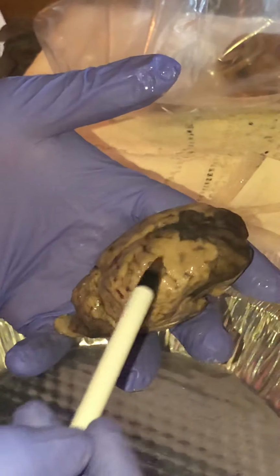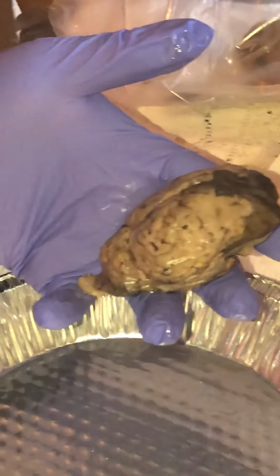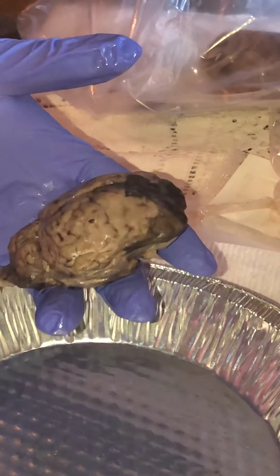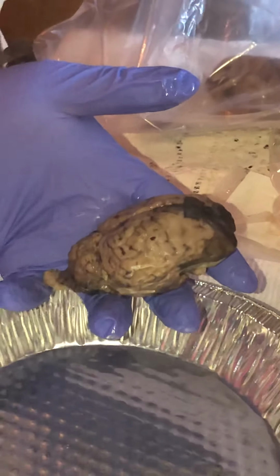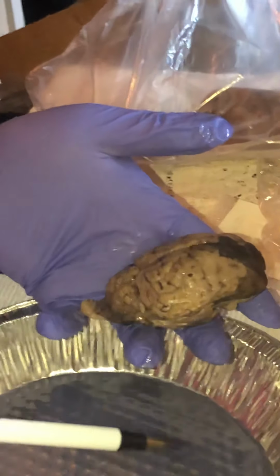Then we have the parietal lobes, left and right, which are right here. The parietal lobes are for memory, proprioception, somatic sensation. And for proprioception, I remember you asked Erica, hey, do you have to look at your feet to know where your toes are? And she's like, oh no. So yeah, that was proprioception.